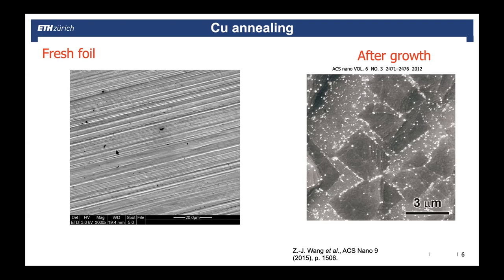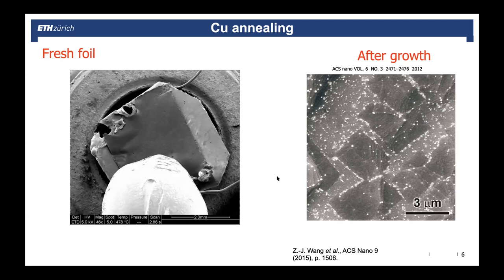We put that into our microscope. This was at the very beginning where we were still using the commercial crucible to heat the sample. So this is basically the top part of the crucible with our copper foil mounted here. What you see here is our attempts to spot weld a thermocouple. So what we normally do is we measure the temperature directly by spot welding a K-type thermocouple onto that copper foil. And copper is a good conductor, so spot welding on copper is not very trivial. So you see that we burned some holes. But anyhow, we measure the temperature with the K-type thermocouple.